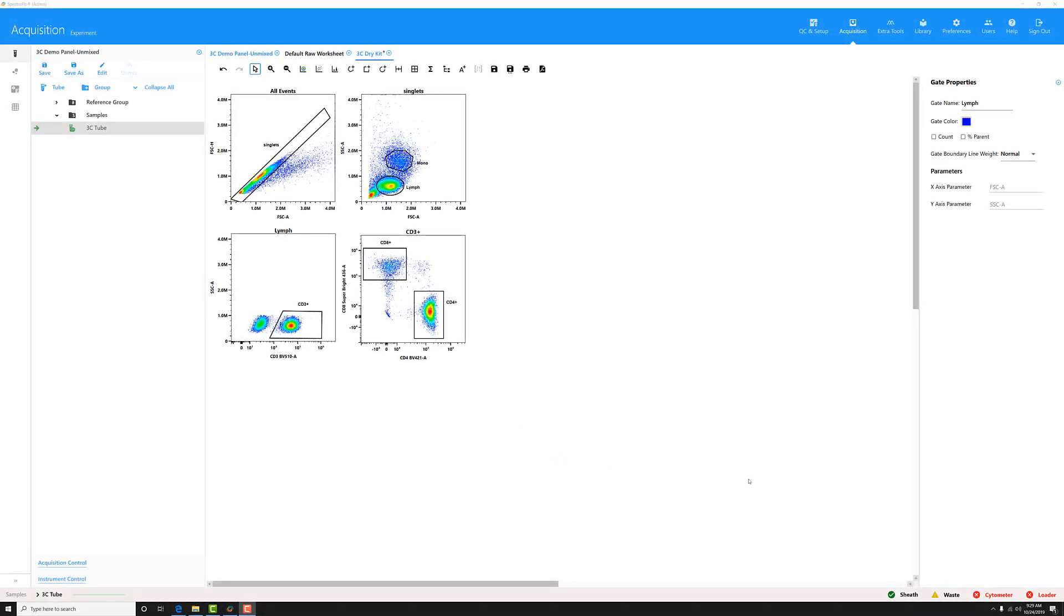With the release of SpectraFlow 2.2, there are now three different Boolean gates that you can use: the NOT gate, the AND gate, and the OR gate.